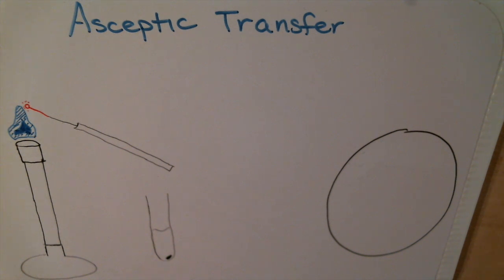Your lab professor may have another way of doing this. There are many ways, all of which are correct, but the way that I like to do it is to streak from the top to the bottom and rotate the plate so that I can always do it in this fashion.